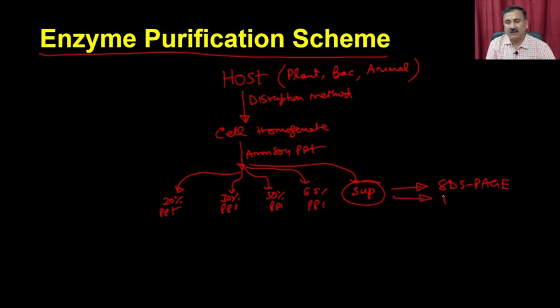also do the activity of the enzyme, and you can also do the protein concentration. Okay, and that is actually going to be a guiding force whether the purification is going in the right direction or not. Because if you are doing some procedure and it is giving you no activity, for example, there will be an activity loss, then the purification is not good actually. So then you have to modify the scheme.